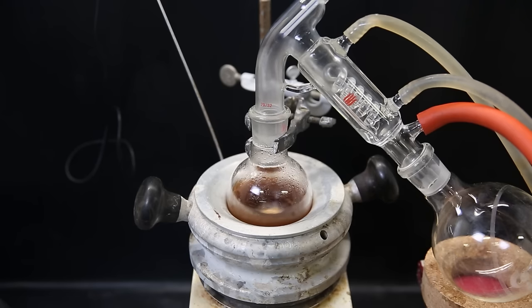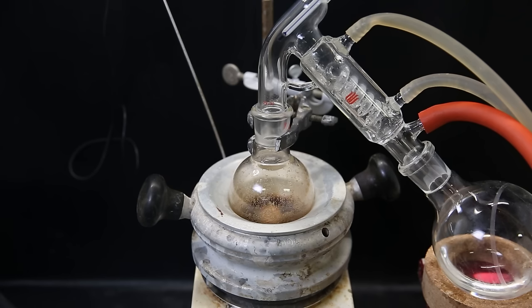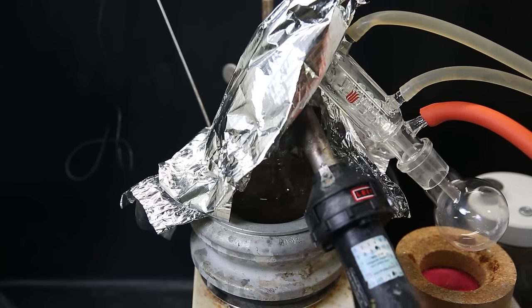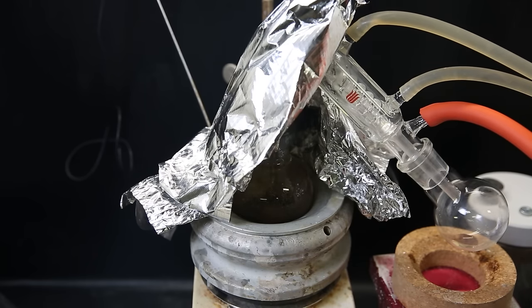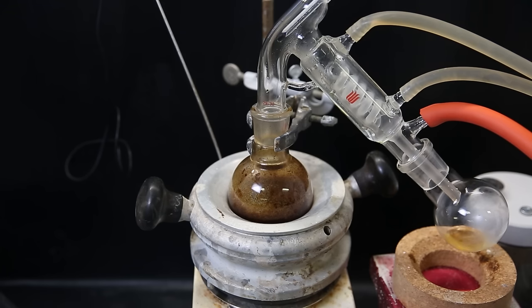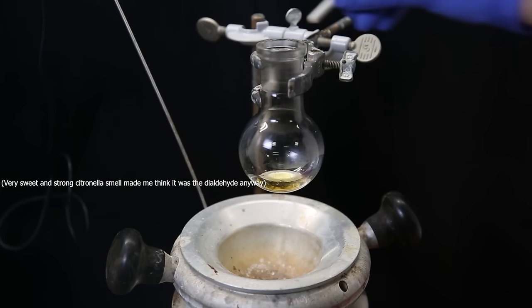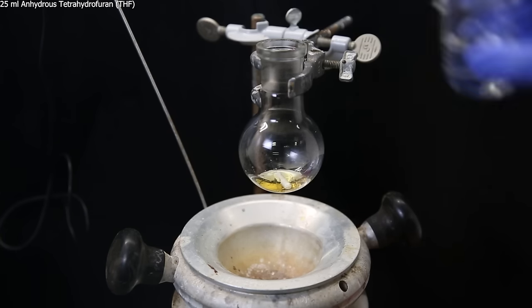that failed. So I attach a short path distillation apparatus, I distill off all of the acetonitrile, and then swap the receiving flask, pull a strong vacuum, and increase heating to start distilling over the product. Some yellow oil starts coming over, which hopefully contains the product, but it is only a little bit. I take this oil, and assume it contains my product. I add in a stir bar, and then 25 mL of anhydrous THF.